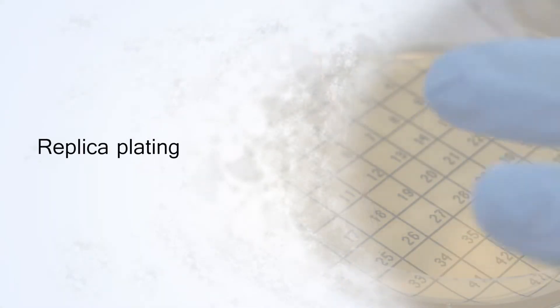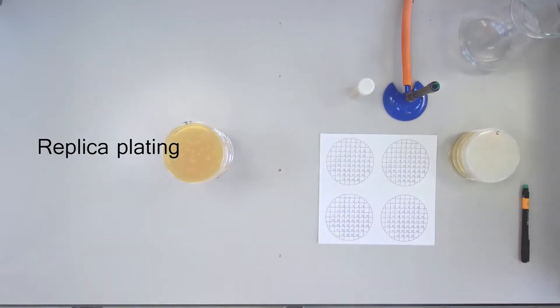Replica Plating. Here we are going to screen transconjugants for a number of activities. Retrieve the plates you spread last session. Remember, anything growing on both ampicillin and tetracycline should be a transconjugant from the filter mating of the donor and the recipient.